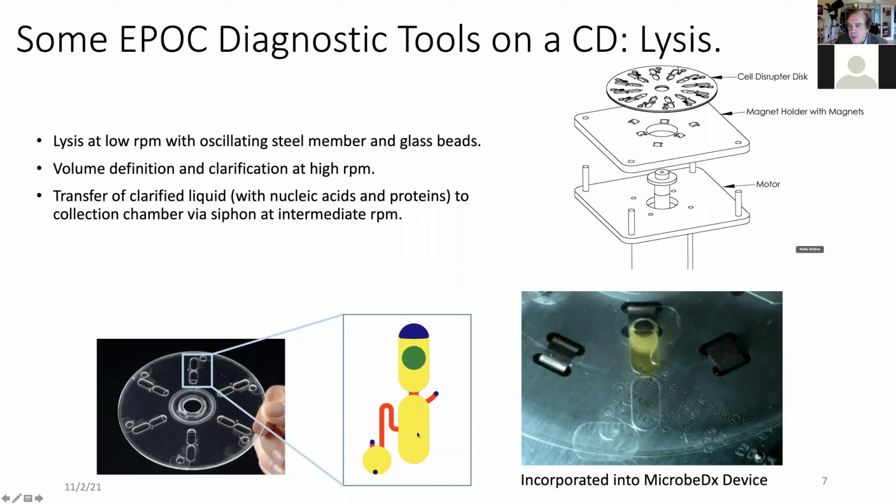a while. Centrifugation happens so that the heavier elements settle at the bottom, and the proteins and the DNA, the smaller fragments that you want, accumulate on top here. So at a certain point, when I think I have enough fragments that I need, when this is high enough, I slow down the spinning, and now this top material that's above this intersection here can move up against the centripetal force, because now surface tension is dominant, and empty in this chamber.